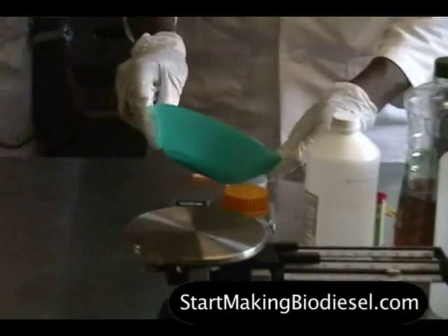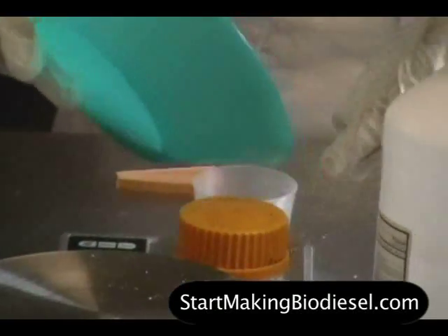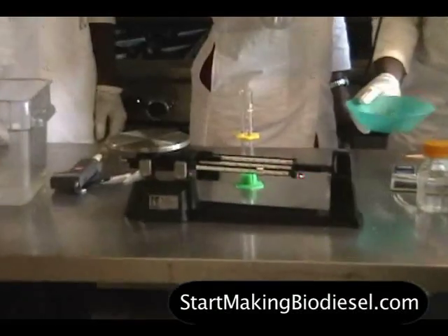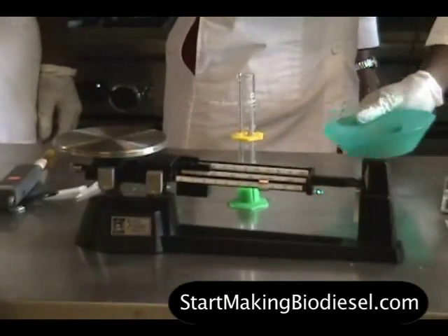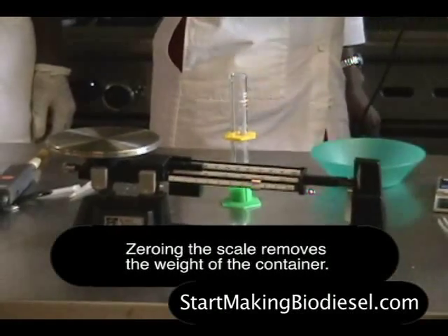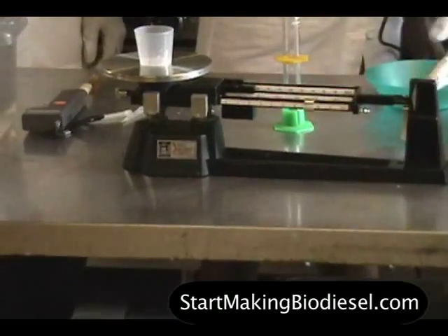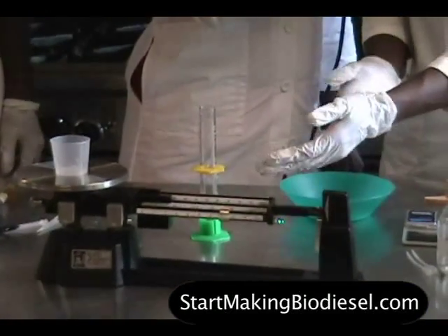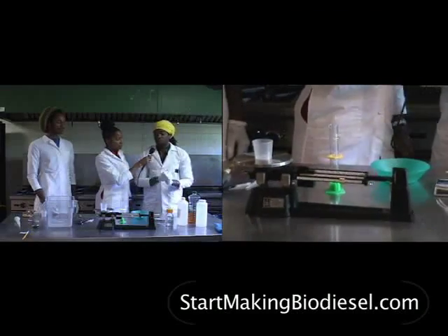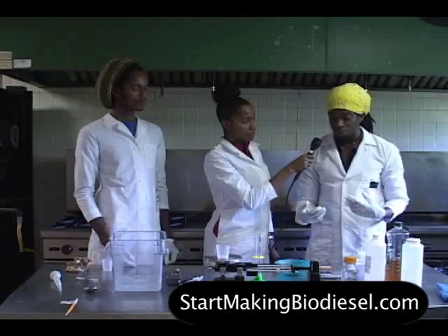If you didn't have a digital scale, you can also use a manual scale — this is a triple beam balance scale, and it works the same way, but zeroing the scale is a little bit more intensive. You would have to measure out the actual weight of the container and subtract that out so that you can get an actual gram of sodium hydroxide when you're measuring it.